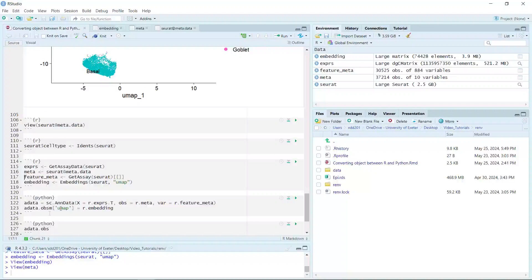Now we can convert the Seurat object into an AnnData object. We will use the expression count matrix, metadata, and feature data to create the AnnData. Then we add the UMAP information into the AnnData object.